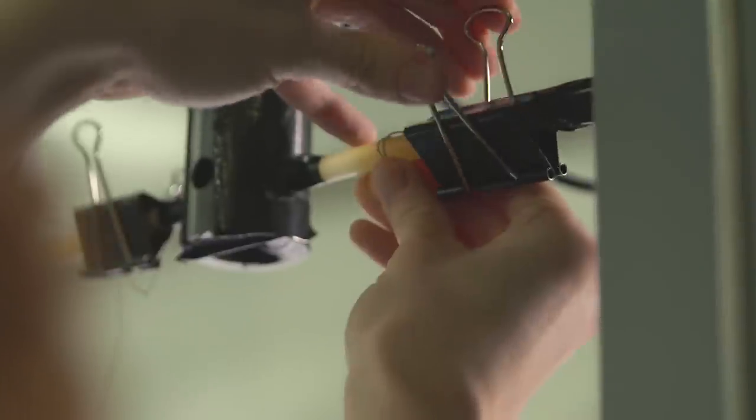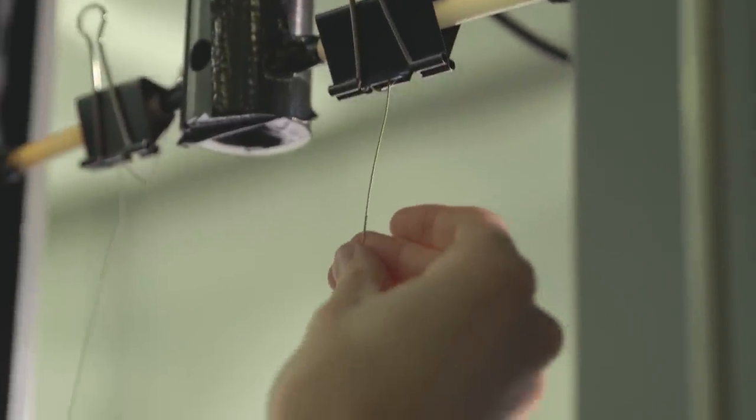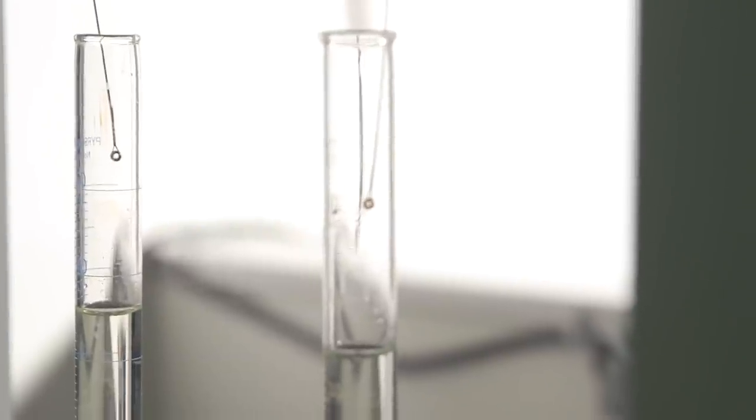The second analysis is a series of cyclic corrosion tests. The objective is to see how the surface treatment of the Ernie Ball Paradigm wire improves the corrosion resistance versus a traditional wire.